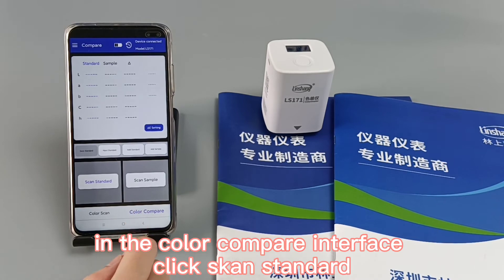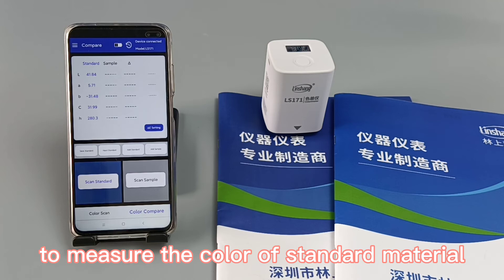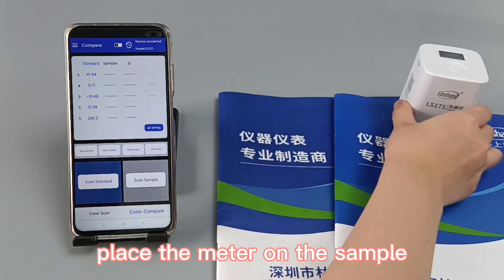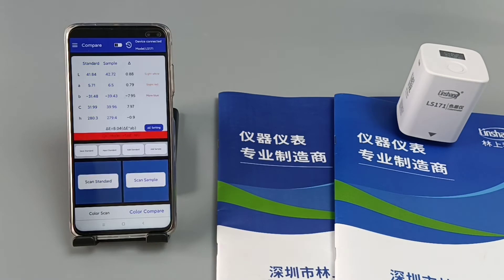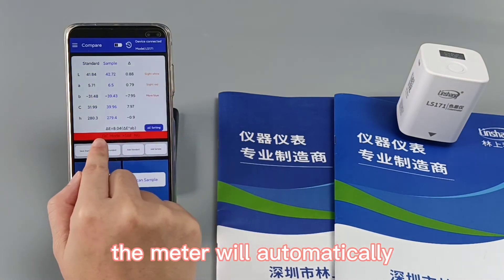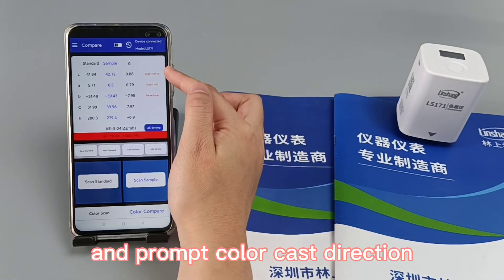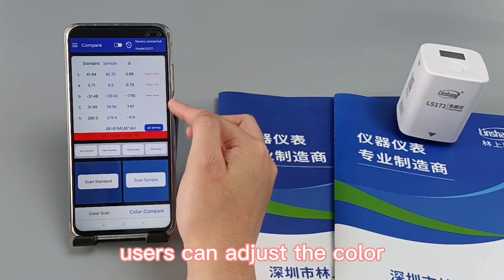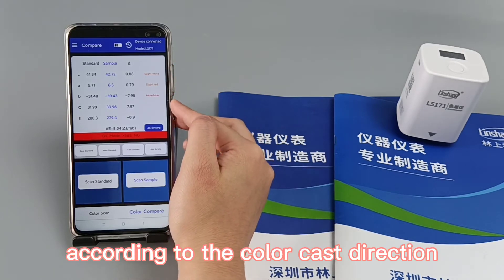In the color compare interface, click scan standard to measure the color of the standard material. Place the meter on the sample and click scan sample. The color comparison is completed. The meter will automatically calculate the color difference and the proposed color cast direction.